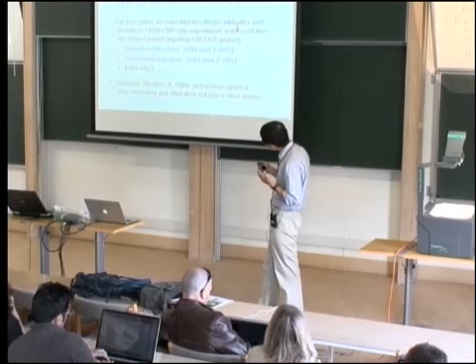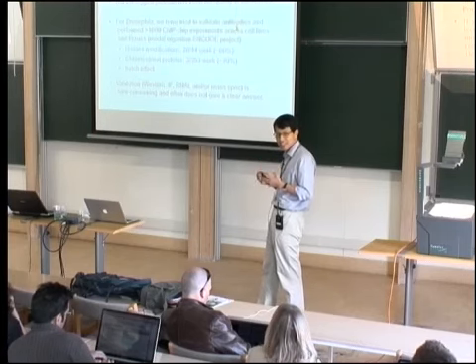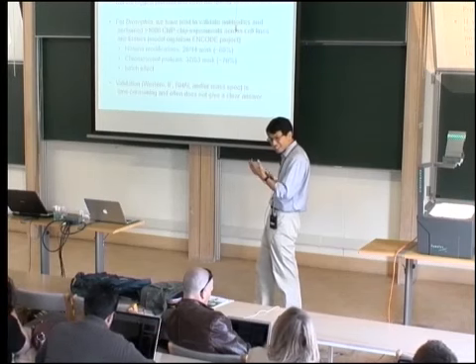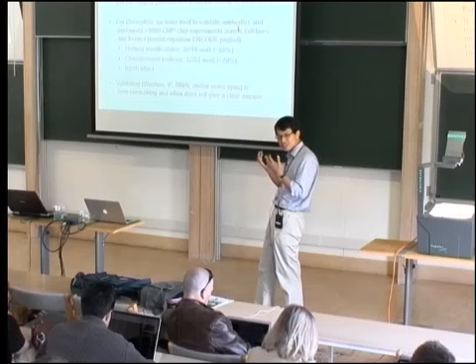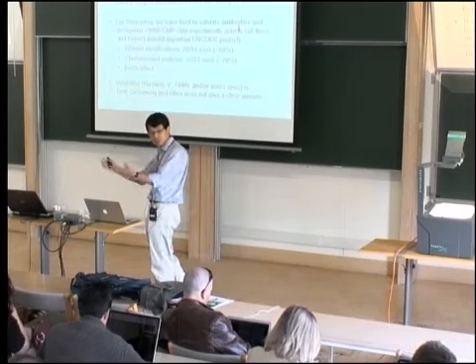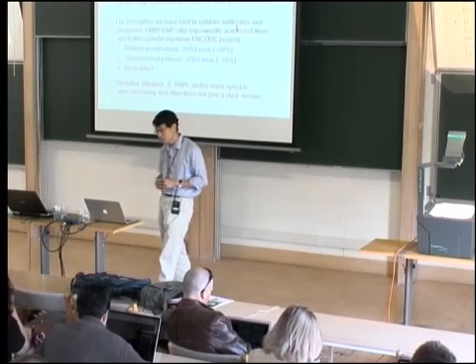Okay? And one problem is that people don't really agree on how to validate these. So when we go through a bunch of steps, and some of these are very time-consuming, the fact that it would be validated in one or two of these does not necessarily mean that the ChIP-seq profile is correct. So this is a difficult issue for the field, and people have a tendency to just publish whatever profile they get if there's something interesting without really going through all these steps.